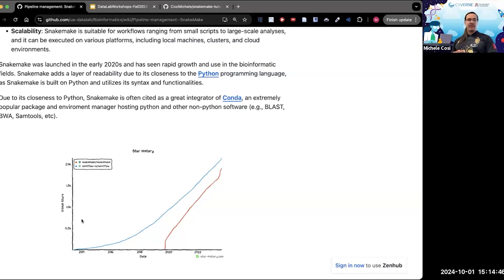And I wouldn't be surprised if going forward, perhaps your PI or your coworkers will ask you to, hey, make your pipeline more reproducible, and you will have to boil it down to two, Nextflow or Snakemake. So think about learning either one or the other for reproducibility reasons.